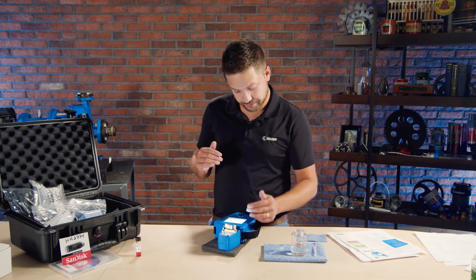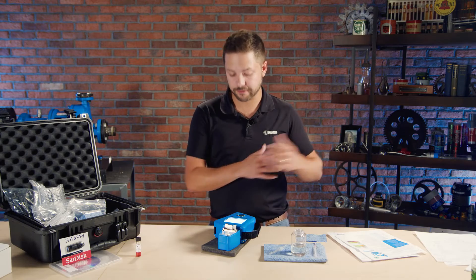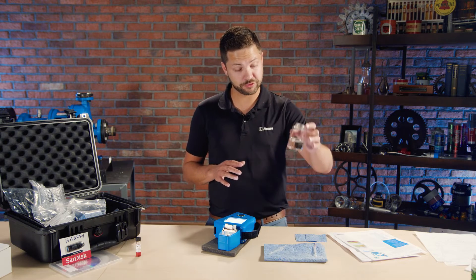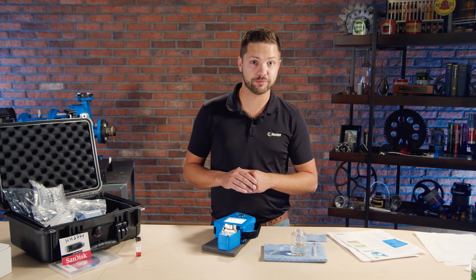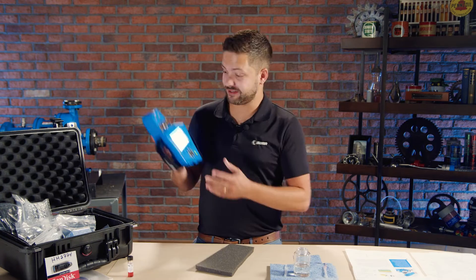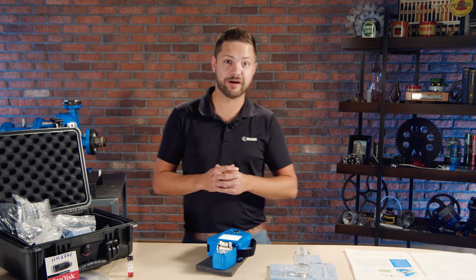Here I have the results already. It's showing me an acid number — which I forgot to mention. Total acid number; if it was an engine oil, it would test for total base number. So here we have an acid number showing water and oxidation level, and there's an overall fluid integrity reading. You can add more values when you create a reference for a selected fluid in the database — they have almost 900 lubricants referenced. If that fluid is in the system, you can test a whole bunch of parameters; if it's not, you can add it pretty easily. It's handheld, so you can walk around to different machines and test oils, or just keep it on your desk — it's battery powered, so the options are yours.